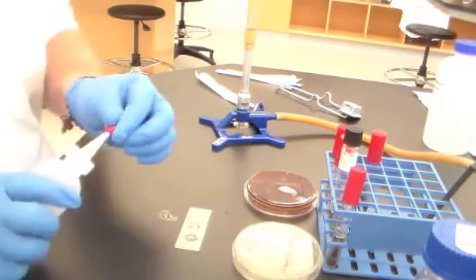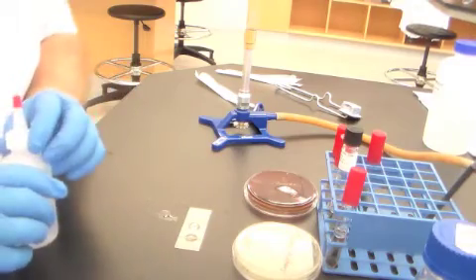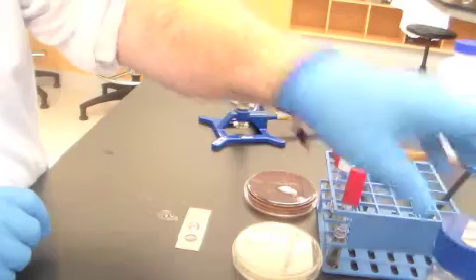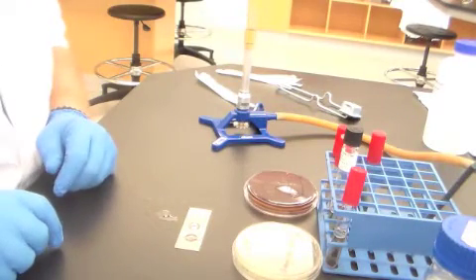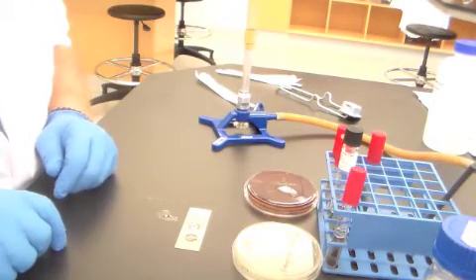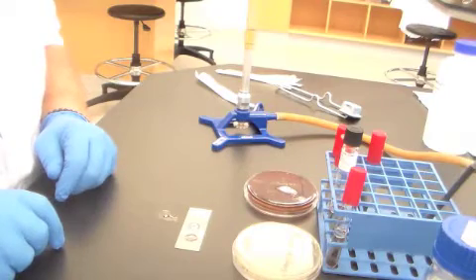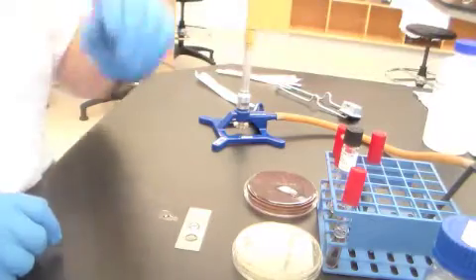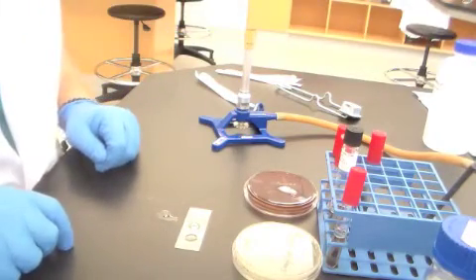Now, for your purposes, the reason why you want to remember this test is that when you get your unknowns, one of your unknowns is going to be gram-positive. And I can guarantee you that all of the gram-positives that are possibilities for your unknowns are either staphylococcal species or streptococcal species.